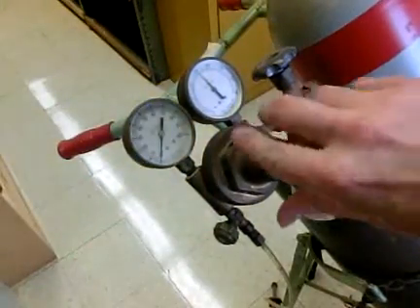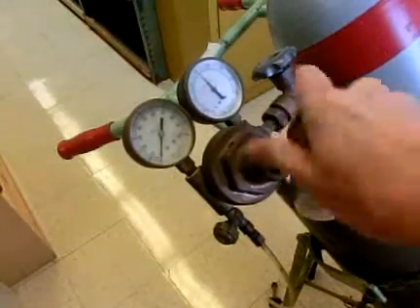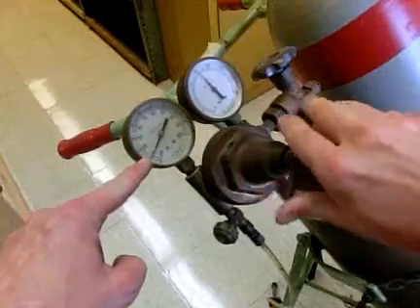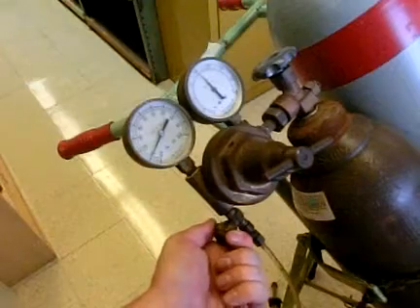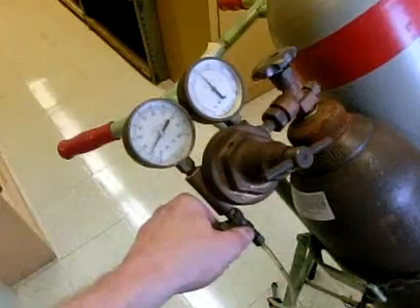To allow that to happen, turn this knob and screw it in. When you screw it in, you will notice that the pressure starts to read over here. Once the pressure is reading over there, you can start draining gas out of this container at a controlled, regulated rate.